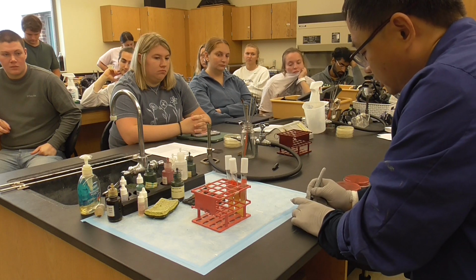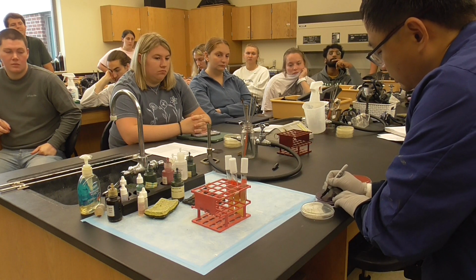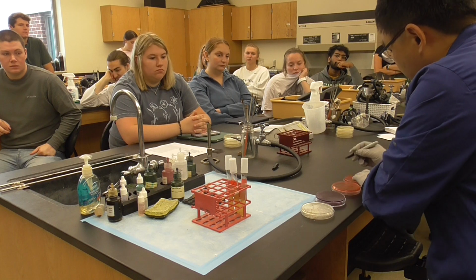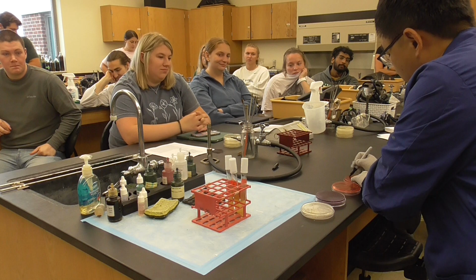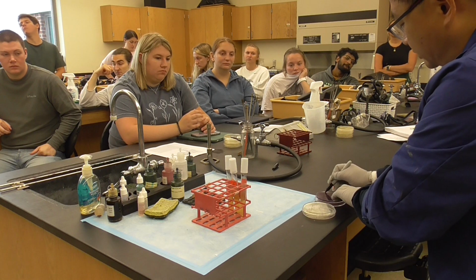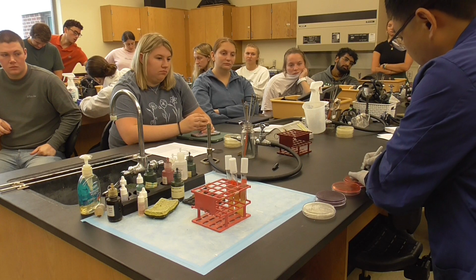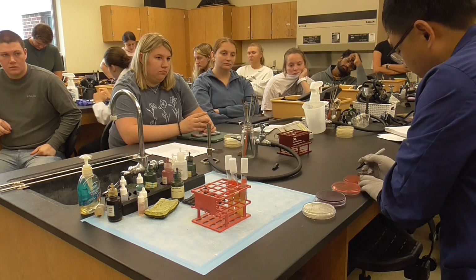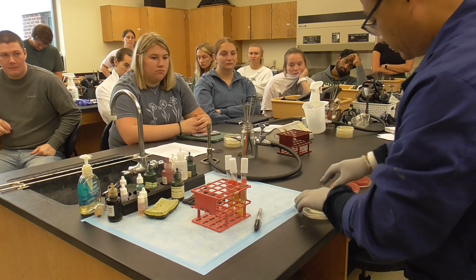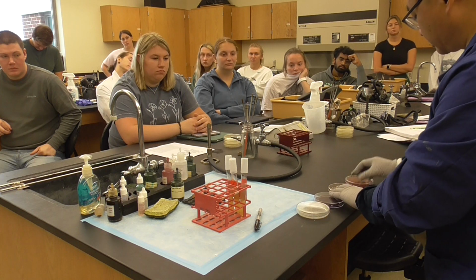Okay, write your name on the side. 26. CS number 1. 26. This is my initial. See? That's not very good. The marker is not looking good. Okay, what are the bacteria we're going to add? EC, LF, CF. E. coli, Lactobacillus, Citrobacter. Okay, let's do the same order. Okay, when you have this one ready, like that, make sure they are in the same order. This is a very easy way to do it.